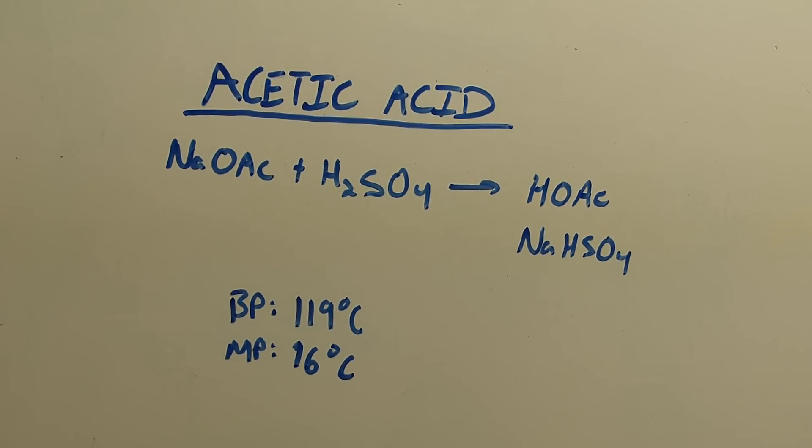Hi everyone and welcome back to the laboratory. Today I'll be making concentrated acetic acid using sulfuric acid's action on anhydrous sodium acetate, which I made in a previous video.